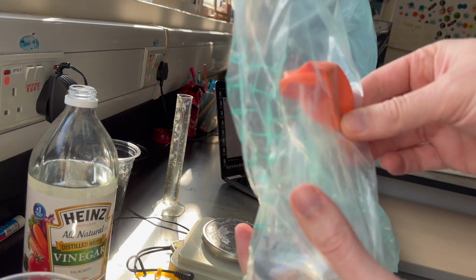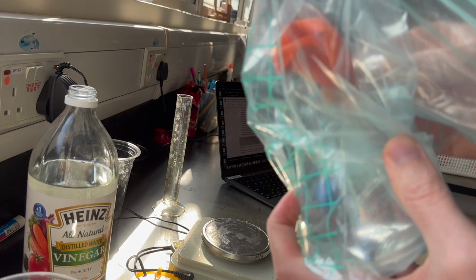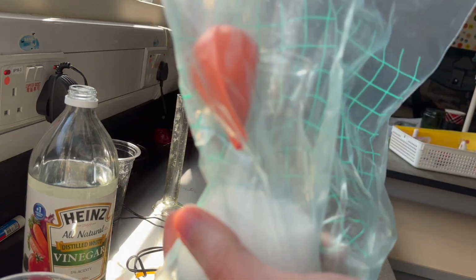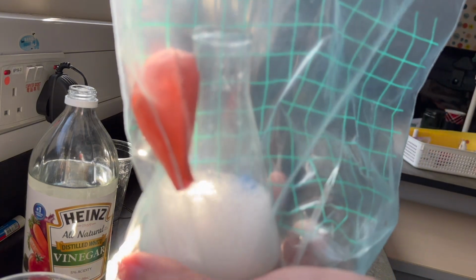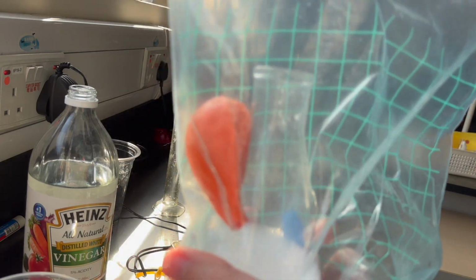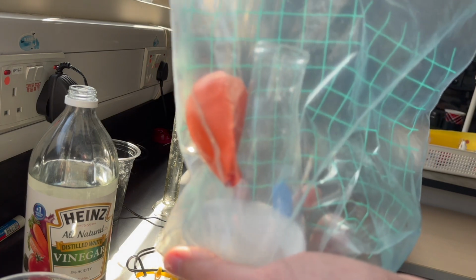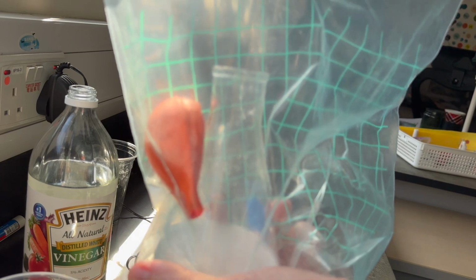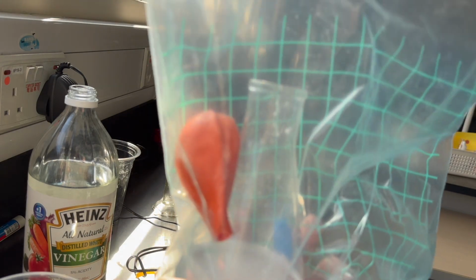Okay, I just need to finagle the balloon. Just allow the gas up. Yeah, that's why we put it in the bag, because the balloon just popped right off. Okay, so if the balloon doesn't pop off, it actually expands and blows the balloon up a bit.